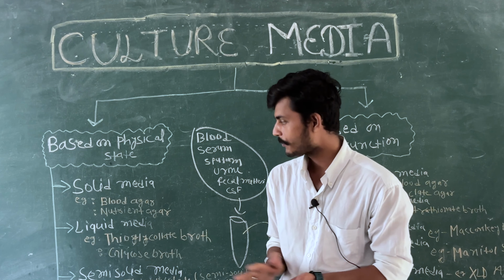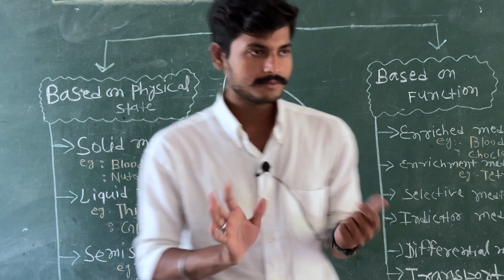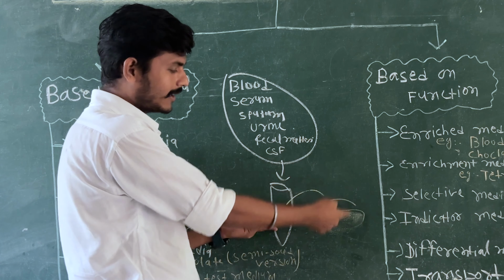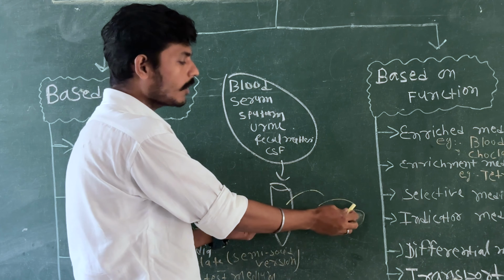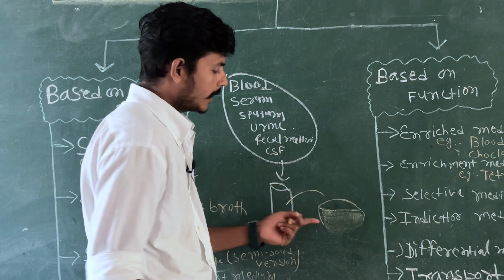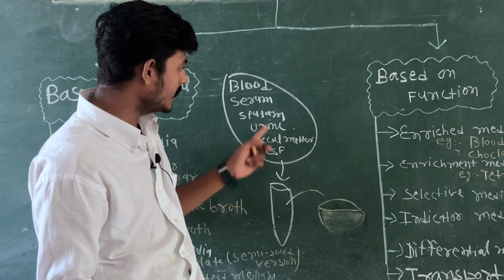Solid media, the same things happen. Fine. We took the sample, put it into the test tube, then inoculated it into the media plate. Now, this all medium is what? Physically, they are all liquids.